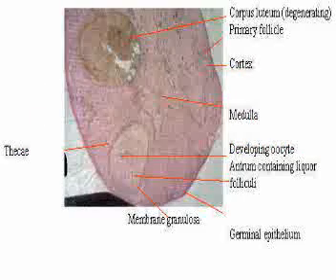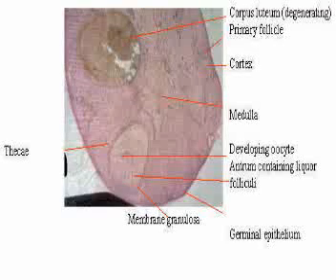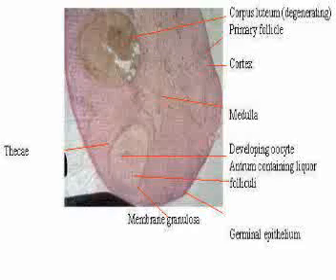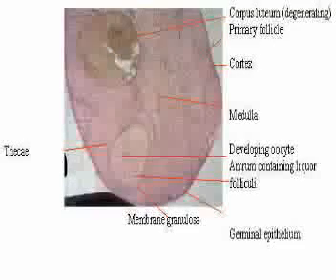The ovary is covered with germinal epithelium. It has many follicles in varying stages of development. The mature follicle is called Graafian follicle. The ovary releases the contained egg through the Graafian follicle at ovulation. After this release, the remaining follicle forms the corpus luteum.